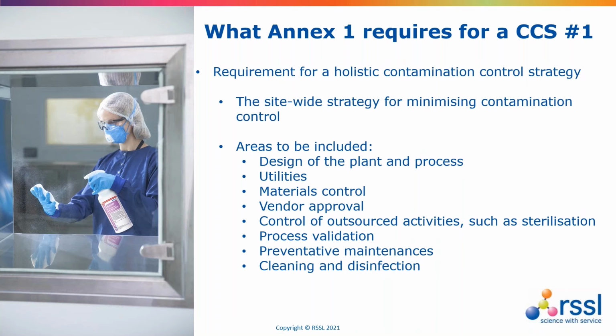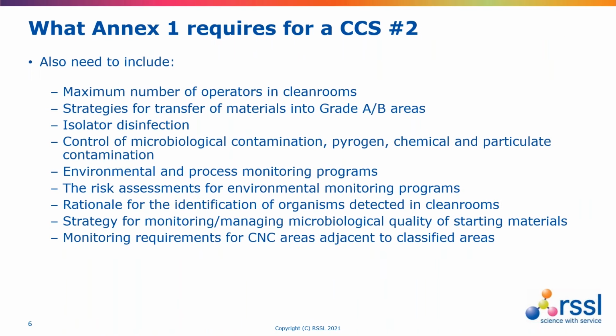To this, we can also add preventative maintenance and cleaning, disinfection, and so on. And the focus is going to be on contamination and cross-contamination, and this needs a degree of scientific understanding supported by technical procedures and appropriate controls. And then below that, there are some more nuanced approaches of the contamination control strategy that would be included, and we won't have time to cover all of these, but it's just to give you a flavour of the depth that such a document needs to include.